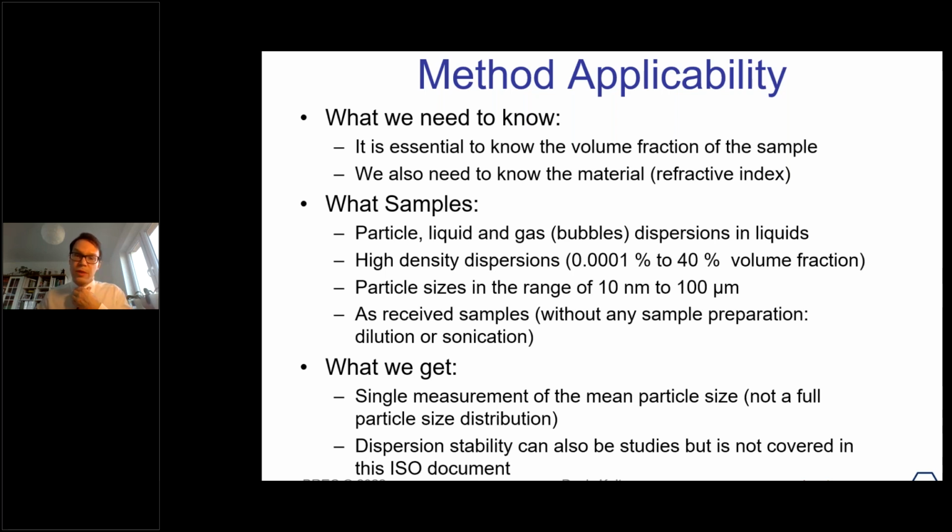What samples can we look at? Well, as if you've used Turbiscan, there's pretty much all of those samples: particles of many kinds, and then liquid droplets, emulsions, and also gas bubbles. So nanobubbles, for example, have been tried. And so these are quite interesting systems to look at.